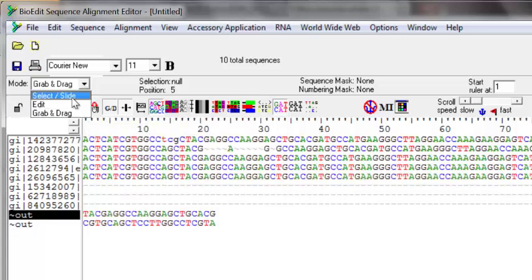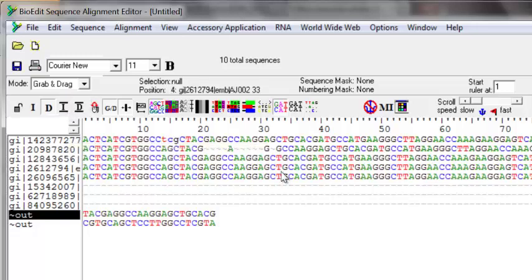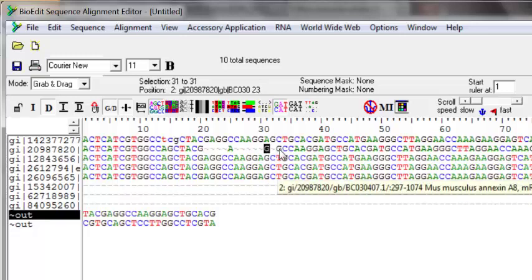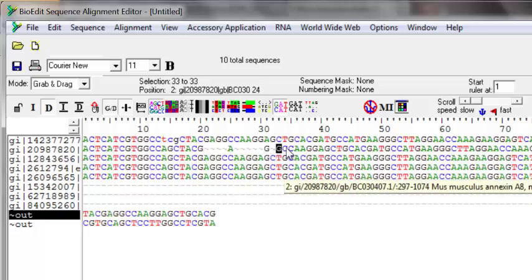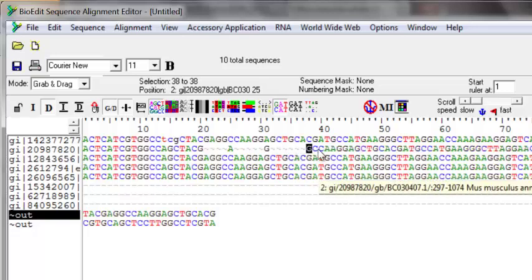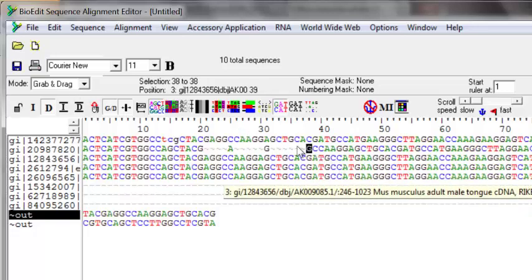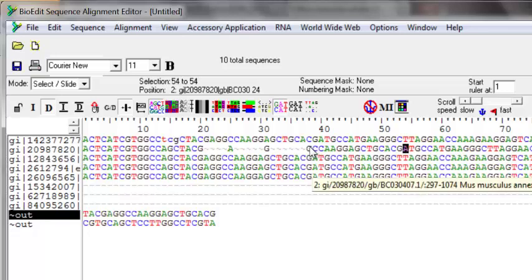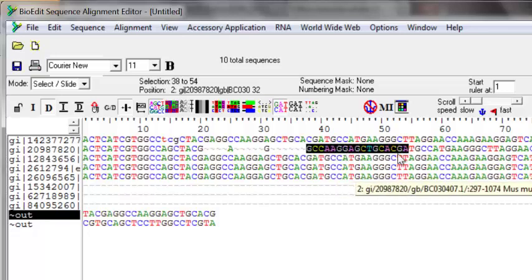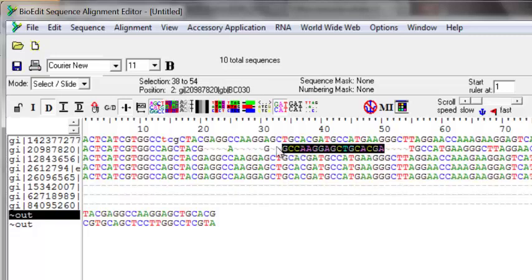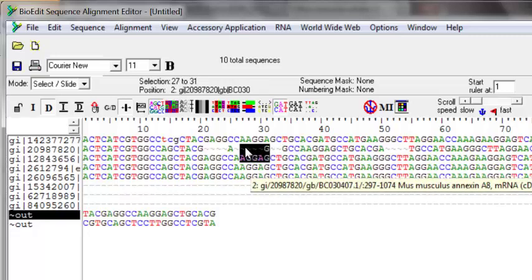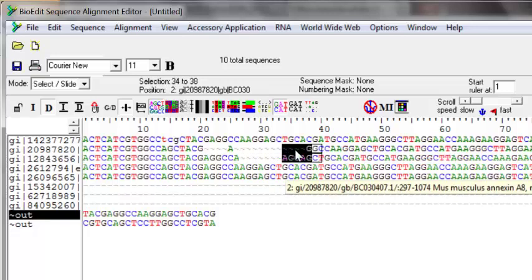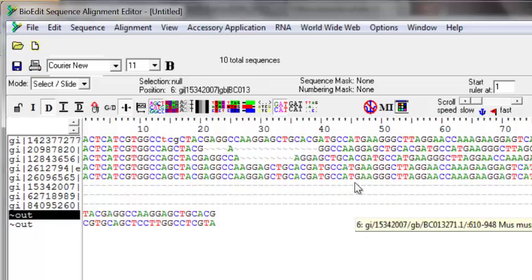The 'grab and drag' and 'select and slide' options look like they do the same function but there is a slight difference. Grab and drag allows you to grab and drag one base at a time — you cannot select two bases and move them together. If you want to move a block of sequence, you have to use 'select and slide'. In that mode, you can select one sequence, then press Shift to define start and end, select that area, and when moving it will move the entire selected block within the allowed region.